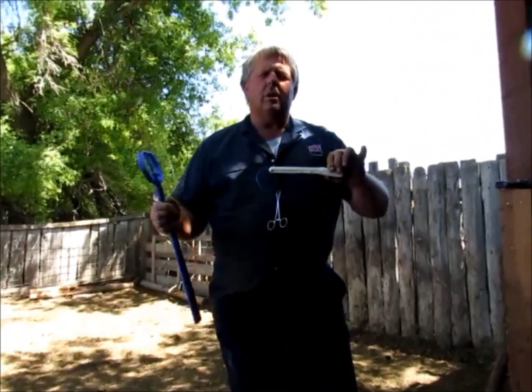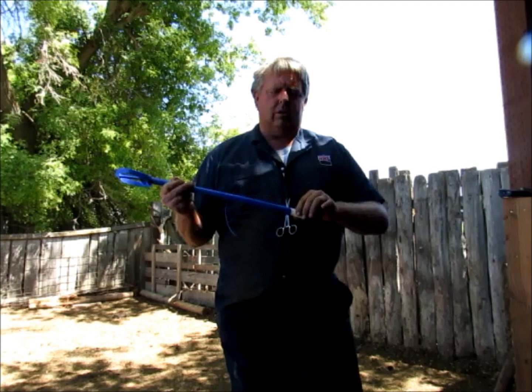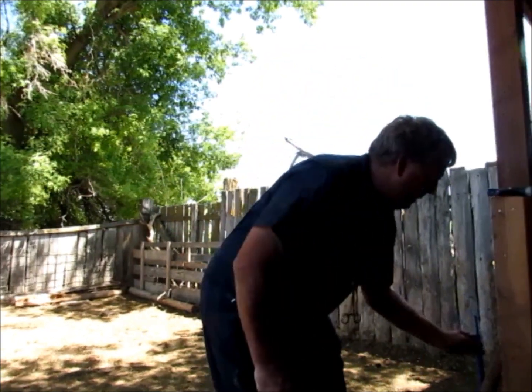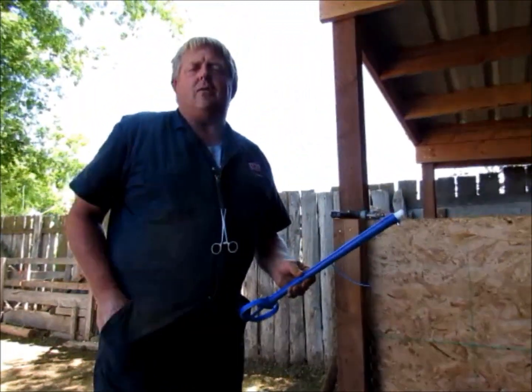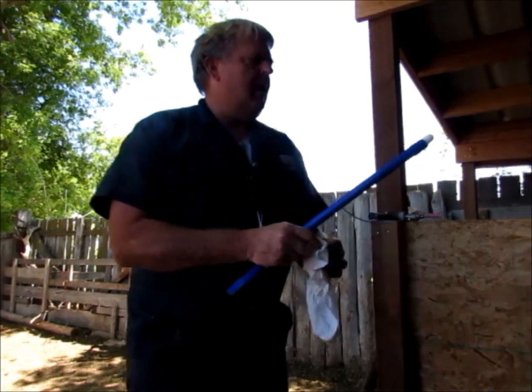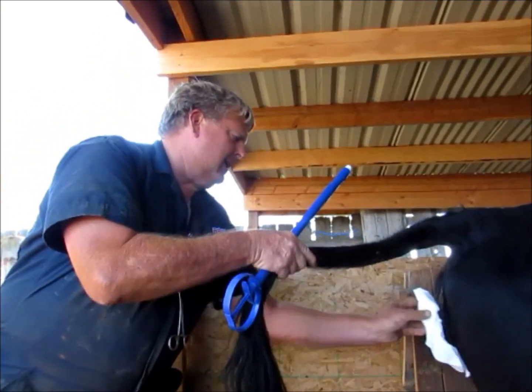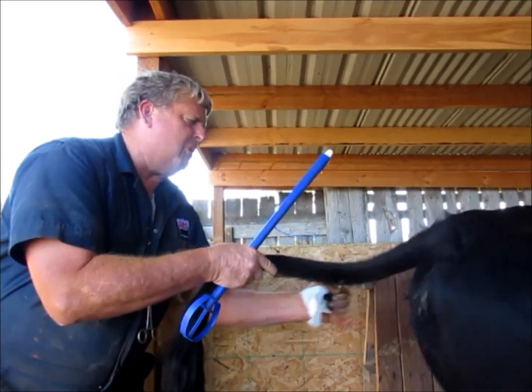This is called a CIDR — it stands for Controlled Internal Drug Release. We fold these wings in, put it inside the gun, and insert it inside the cow. We leave it there for seven days. It's dipped as a lubricant. In seven days we come back and pull it out using the blue string. At that point the hormone is released and they should be in heat in about two to three days after that.